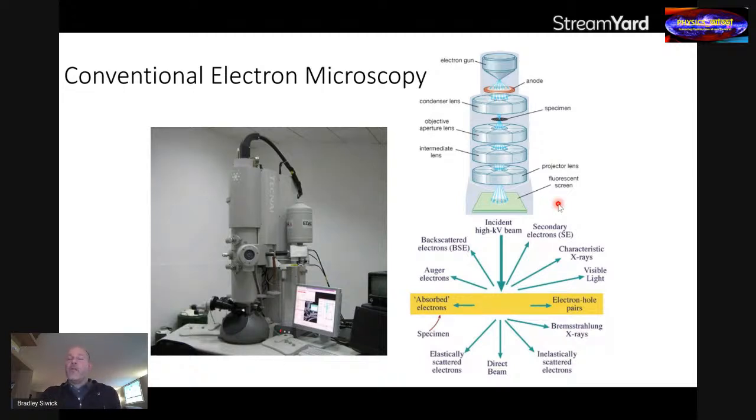An electron microscope, a modern one, is really a signal generating engine that tells you an enormous amount about materials through the various ways that this high energy electron beam interacts with your material specimen. And the primary ways that we learn about materials in electron microscopes is through the transmitted electrons, okay, the electrons that are transmitted through the sample, and those that get elastically scattered or inelastically scattered. So the elastically scattered ones are often used in imaging and diffraction.